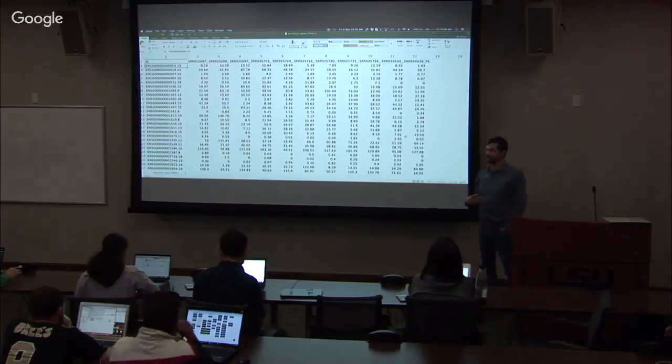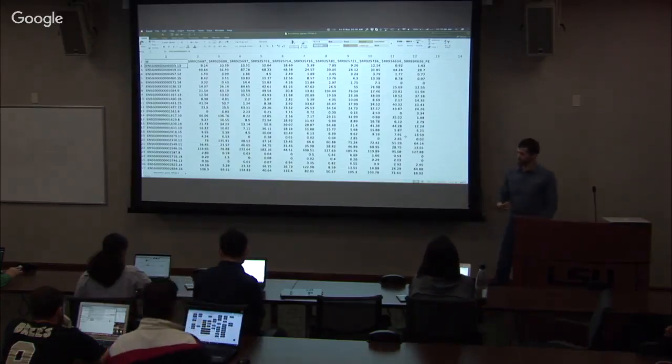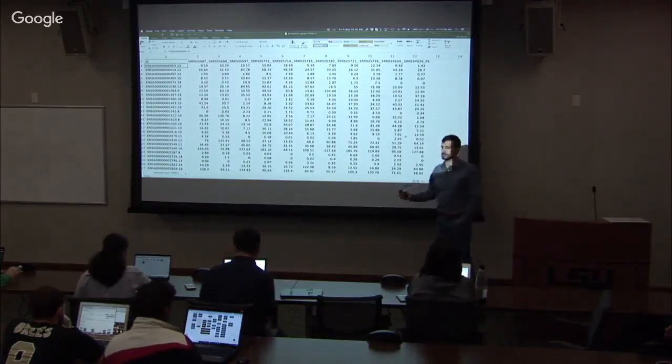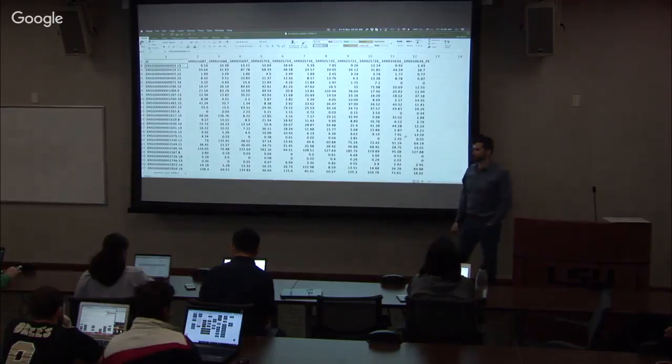So you can download the GTF, and then you will have a FASTA file for the sequence and the GTF file for the positions in that sequence, and then you can upload both of those and use them as reference.